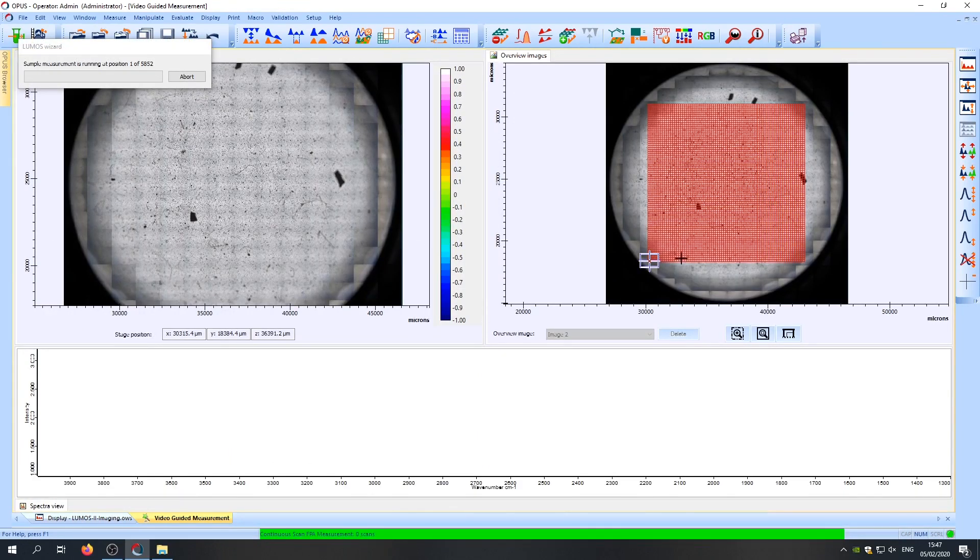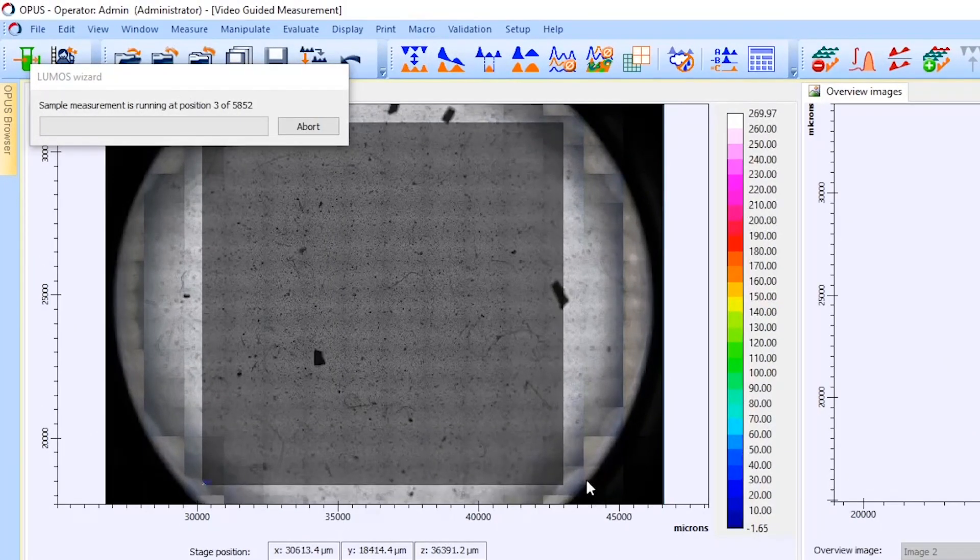In this screen, we will see the movement of the stage as well as a live image of the measurement on the left side.